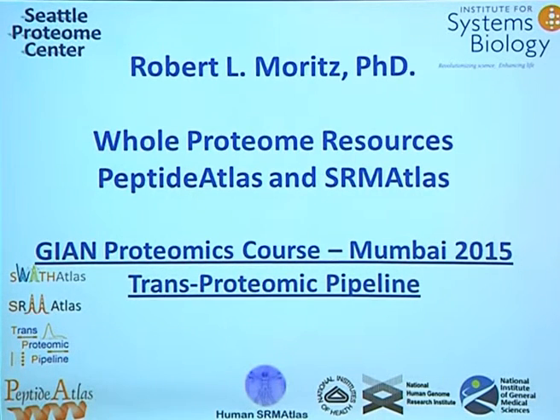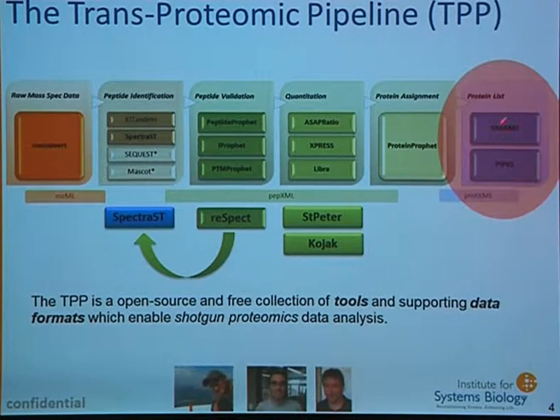And so the two are quite distinct from each other. The PeptideAtlas is really a compendium of all of the different identifications, whereas with an SRM-Atlas we take discrete identifications that are well controlled, well characterized to become targeted proteomic assays. Now, this is where these two things reside in the back end there.